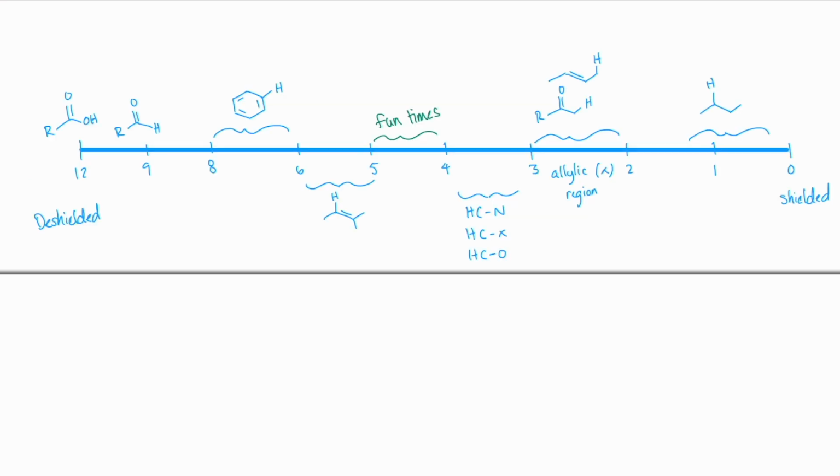But before we get into that, let's go through just the general-ish trends of NMR. I'm going to quickly draw the graph, and then I will be right back. Alrighty. I went ahead and finished my diagram. It's not a very exhaustive list, right? You can search up exact values for all these sorts of things. But like I said, my entire point with this is see if you can understand the general patterns, okay? Some professors may ask you to recall very specific numbers, like, hey, what is the exact isolated range for a carboxylic acid, something like that. I doubt it, because it is a range, and these ranges can be affected.